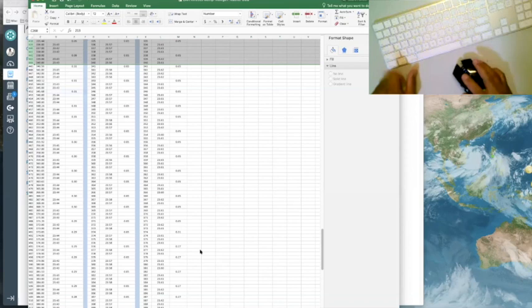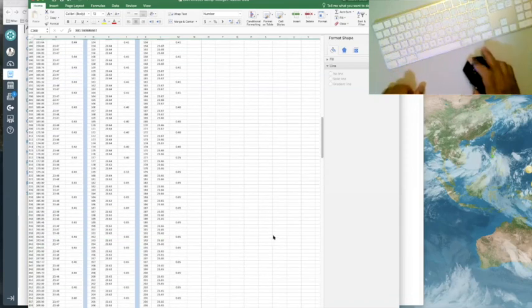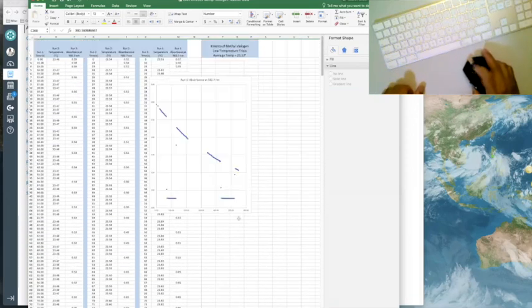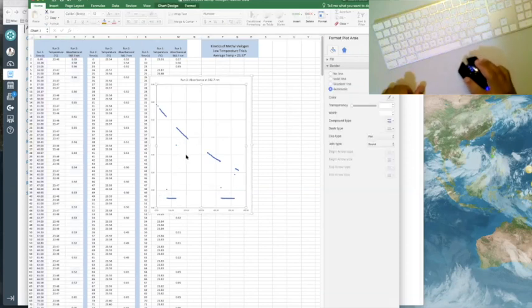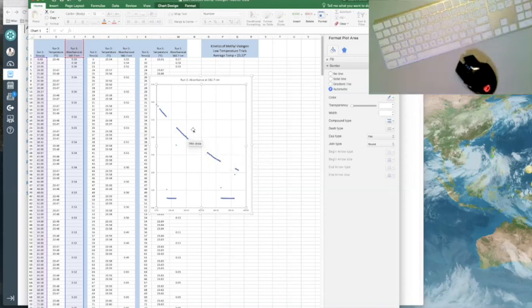And when I do that, look what happens to the graph. That should be gone. In fact, I deleted this segment. I'm keeping these. So you need to thin out your data set by keeping points on this curve, 20 of them, and ignoring points that are down here.